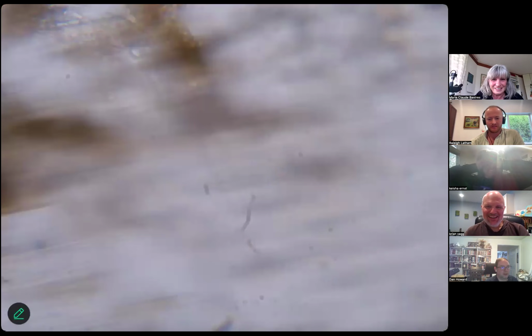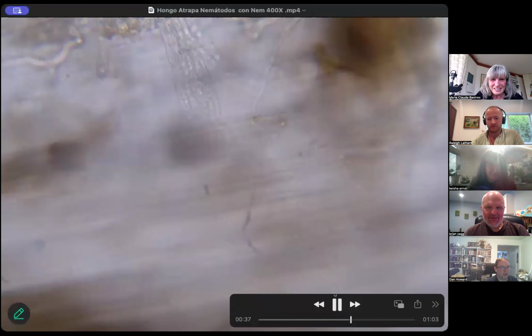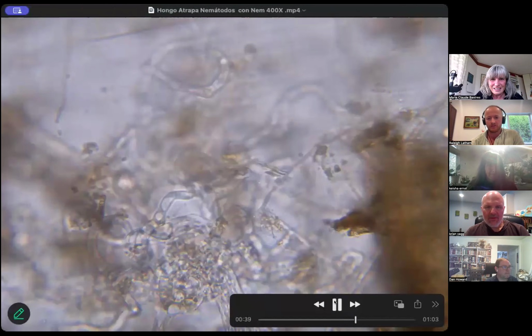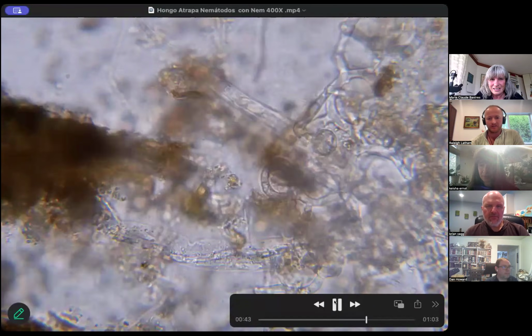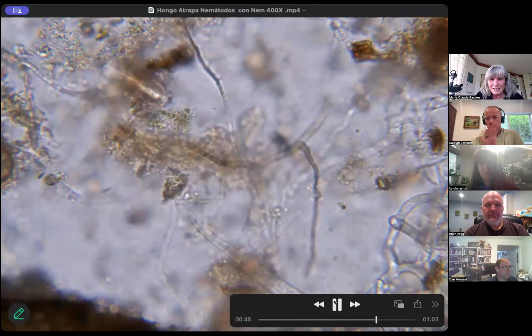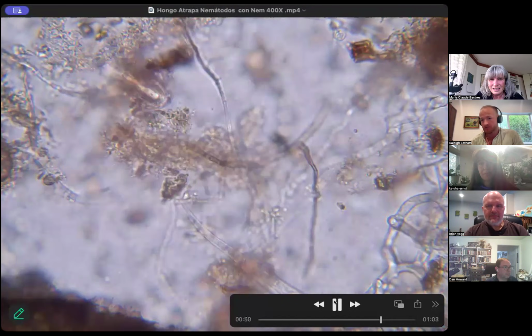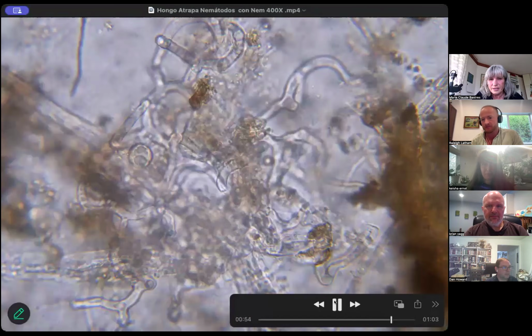Stacy asked about TubeView. Absolutely, we can help you with TubeView settings. I've been experimenting with it, and there are fun tricks you can use to hack TubeView. When I record videos, I don't actually use TubeView, I just record my screen, and you get a way faster frame rate.